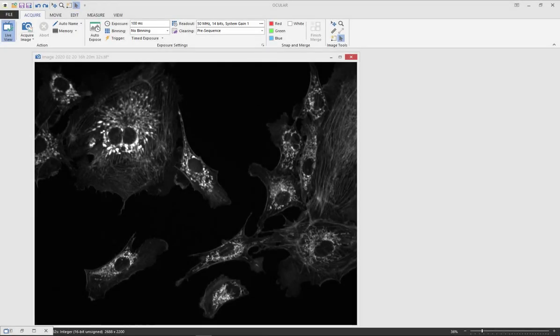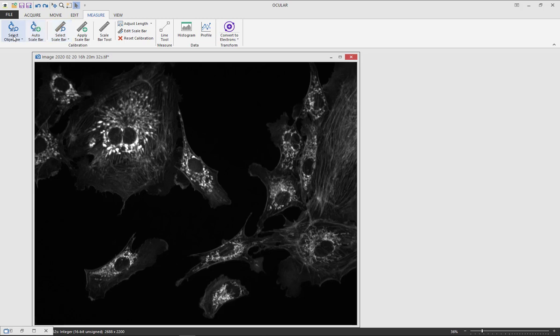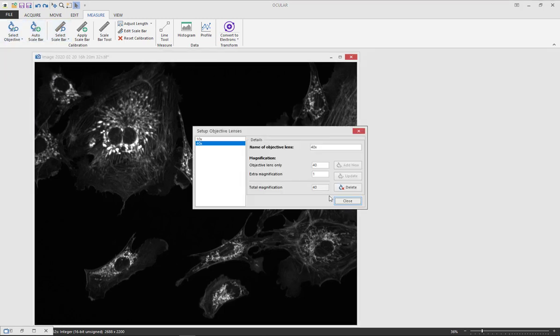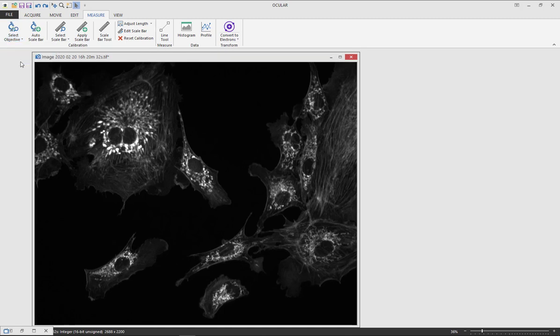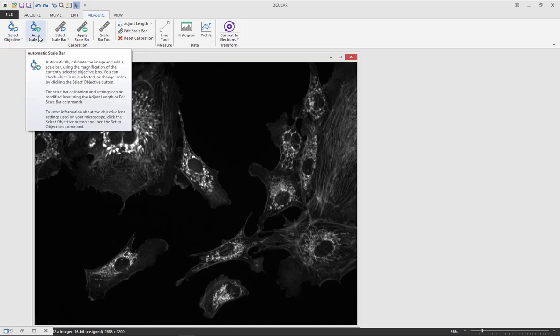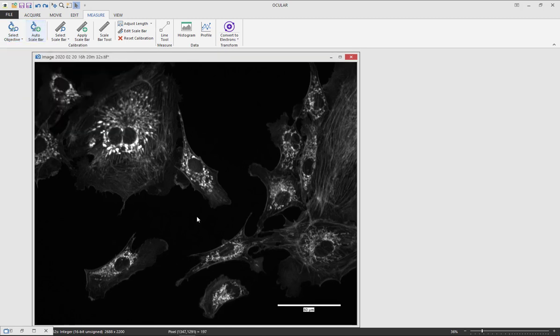You may want to add a scale bar onto your required image. Under the measure tab select your objective. You will need to set these up first. Once you've selected the objective, click auto scale bar and one will appear on the bottom right hand side of your image.